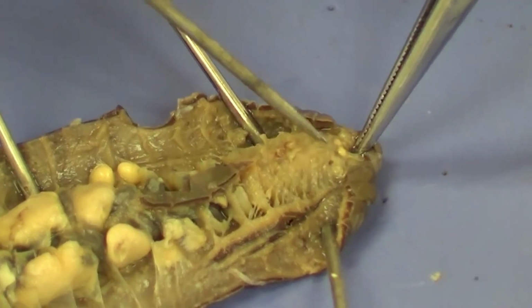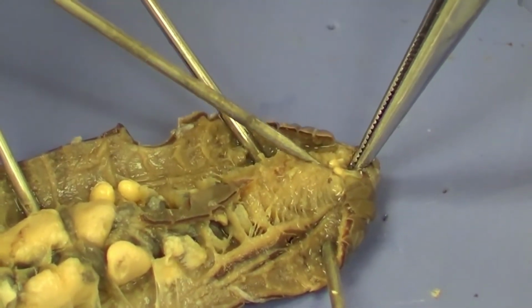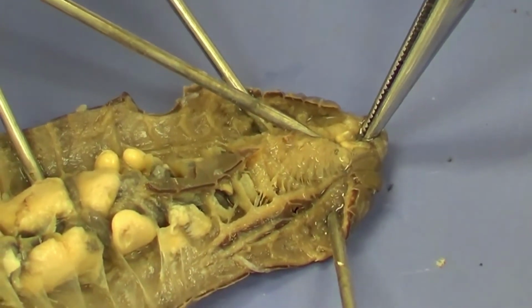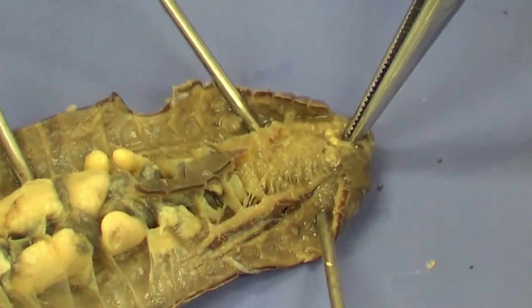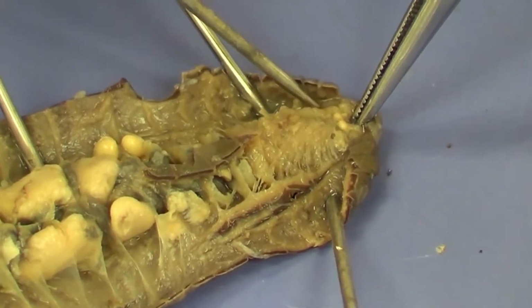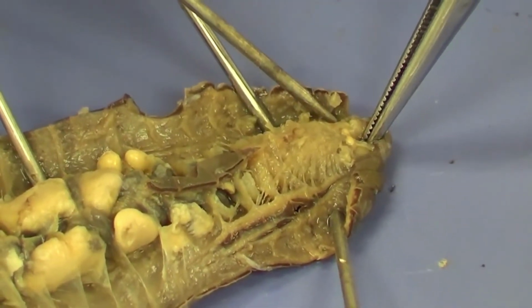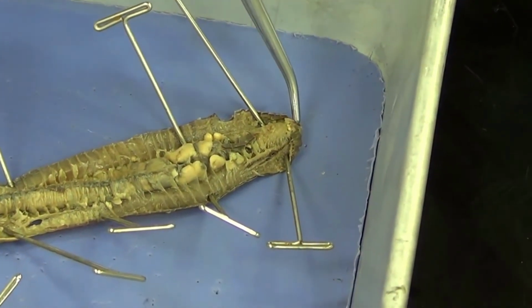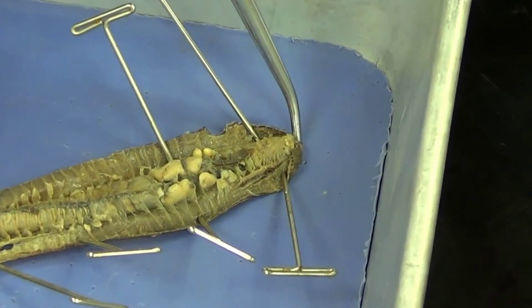And you can see the two little white structures right there at the tip of the pin. Those two white structures are the brain. Eventually the nerve cord ends in those two white structures. That is the brain of the earthworm there, not quite as big as yours. Now let's go through the different parts here. The mouth is the very opening at the very anterior tip.